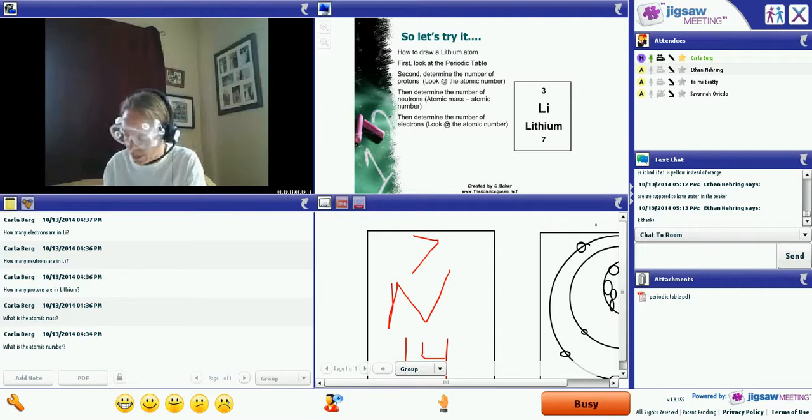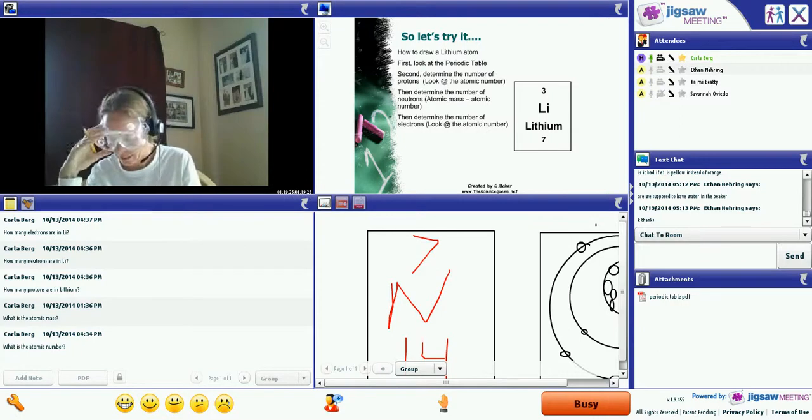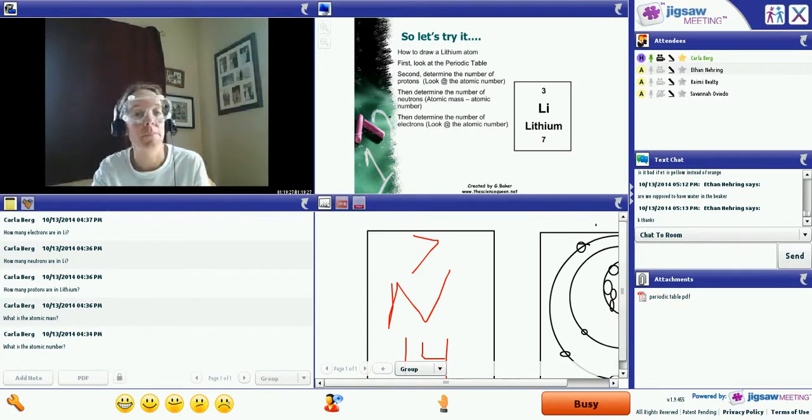So why did these wells get the most precipitate? Well, that's a good question. It's because all of the reactants precipitated. They were able to be used.